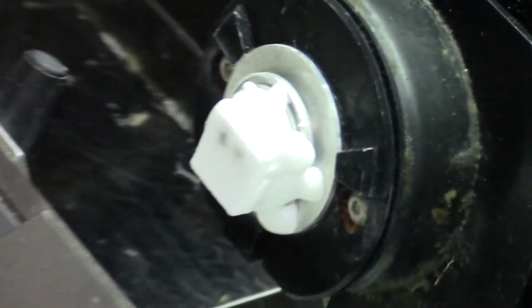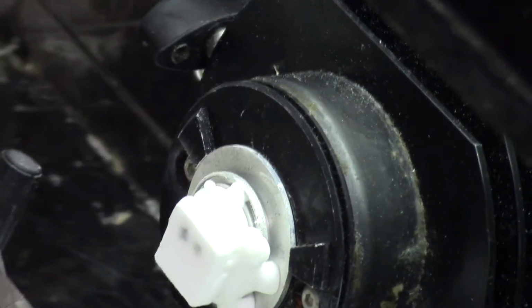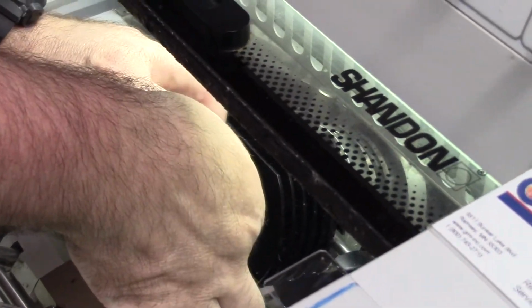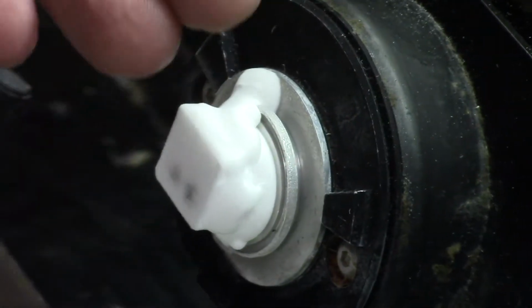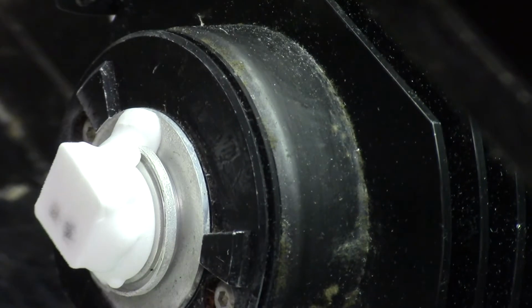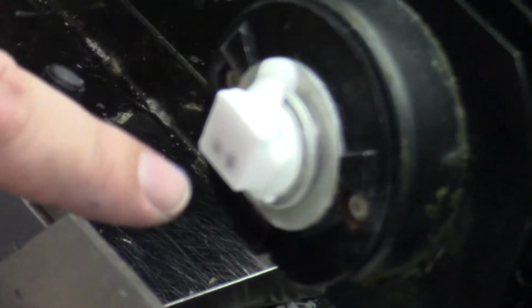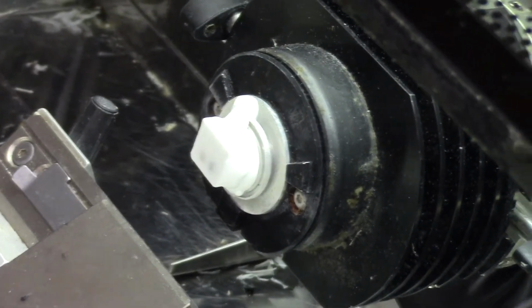When I had them in here, we had it towards the bottom. On the right was the regenerate. It's flipped like that right now. Actually, I think I would prefer to cut it this way. When the knife comes up and through the tissue, it's nice to have extra OCT after you've cut through your tissue. So what is this now? This is flipped this way. So notice the larger piece of tissue is on the right, that's our stump, and the smaller piece is the regenerate on our left. So we can keep that orientation in our mind.